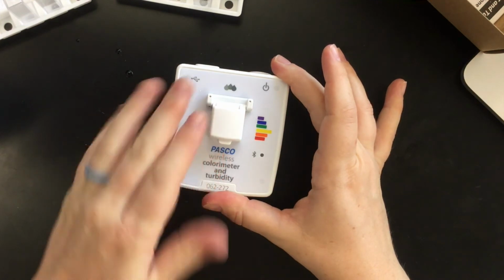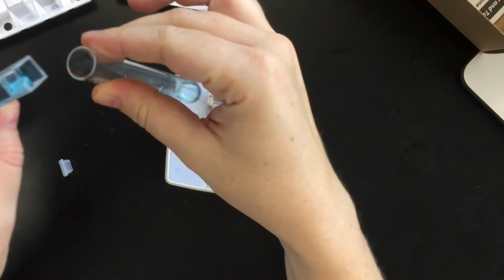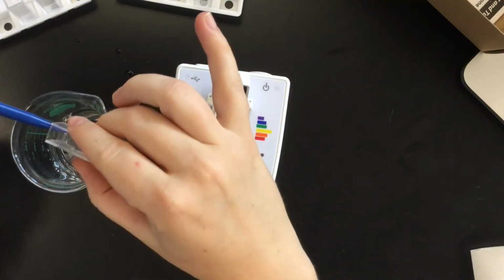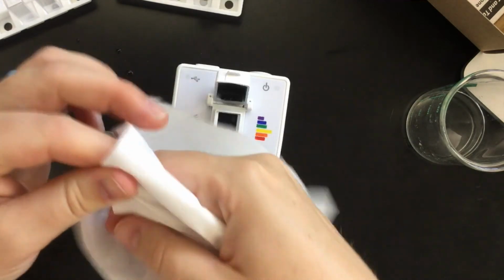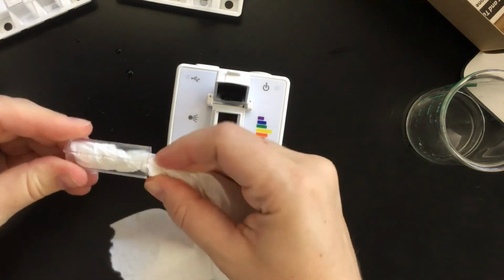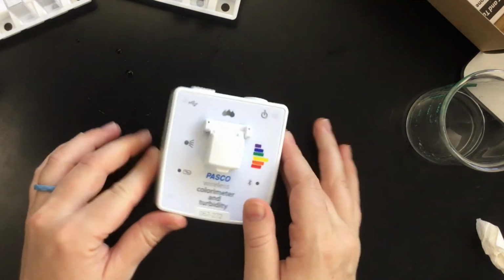When you're finished taking the absorbance of this cuvette, you'll take it out, open it up. You may want to keep this liquid. If you're doing it from test tubes, you can pour that back. Get a waste beaker, rinse it out with some distilled water. Then get a piece of paper towel, make it thin enough that it can fit inside of your cuvette. Dry it off. This way you're not diluting your sample if you put more sample in there. So dry it off, and then put the cap back on, and then it's ready to be used again. When you're finished with your colorimeter, please make sure you turn it off and put everything back in the box.